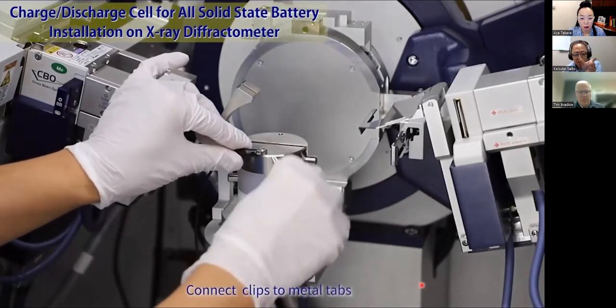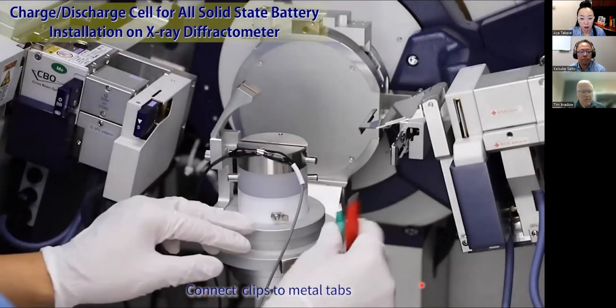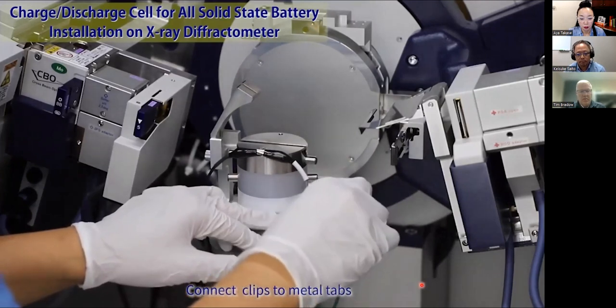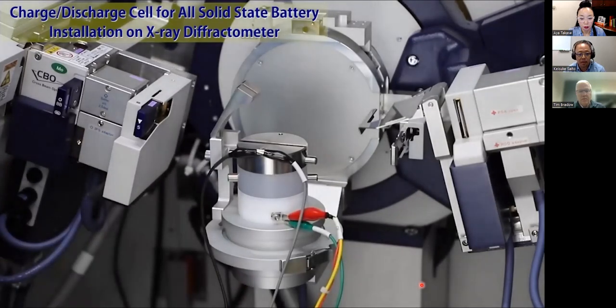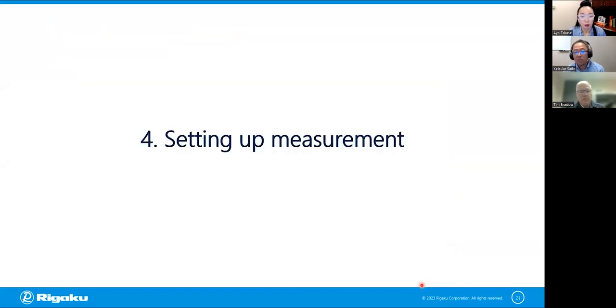Now we put the solid state battery cell and we are connecting to the potentiostat. This is the same procedure as a liquid-based lithium-ion battery. So basically, this is how it works. All right, so this is the end of the sample preparation.